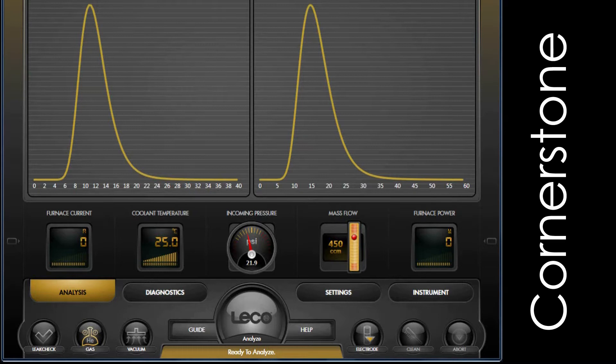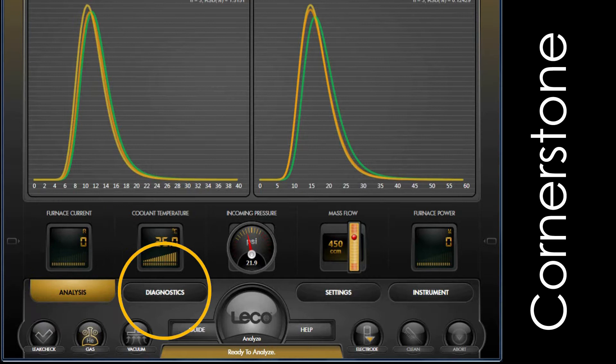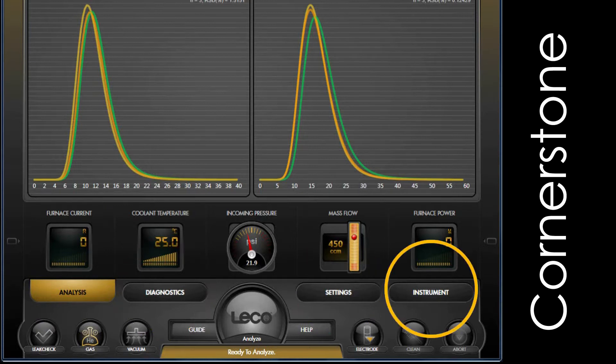As you can see, this software is divided into four main sections — Analysis, Diagnostics, Settings, and Instrument — for simplified navigation and organization.